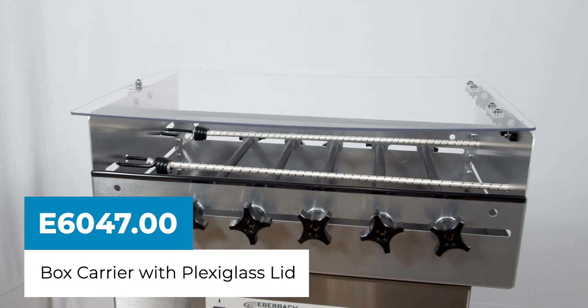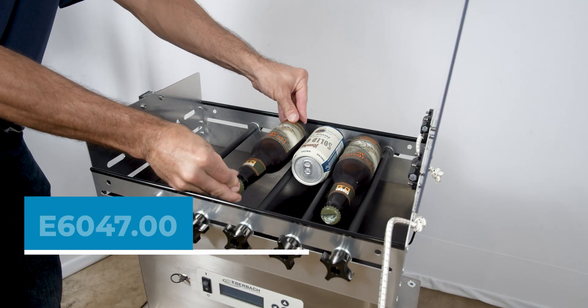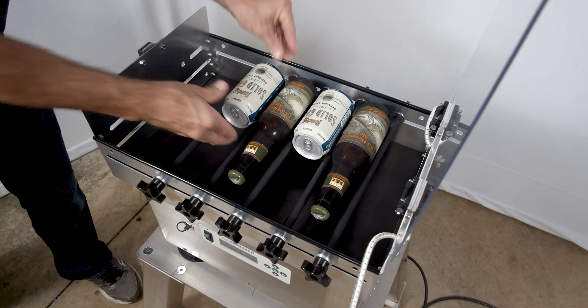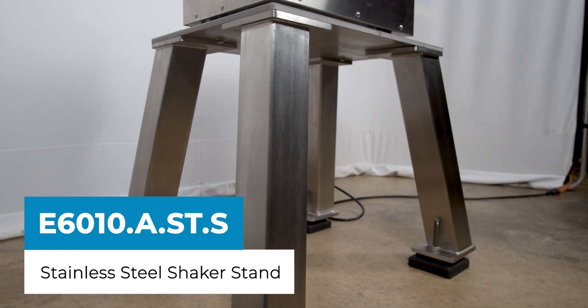The E6047 utility box with lid was specifically designed for TPO and DO testing using both bottles and cans. Eberbach stands can help support vigorous shaking applications.